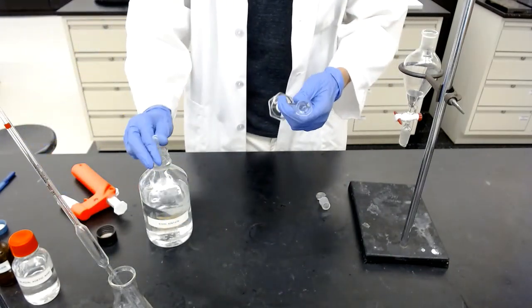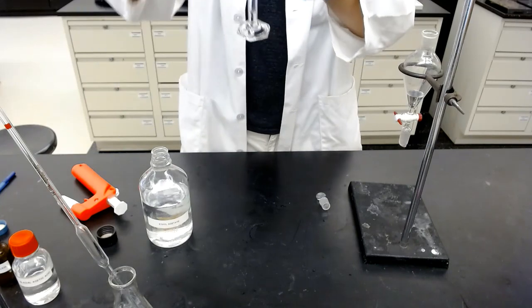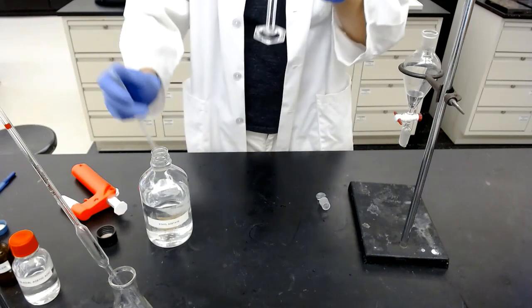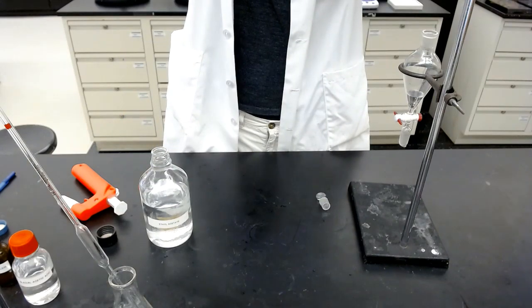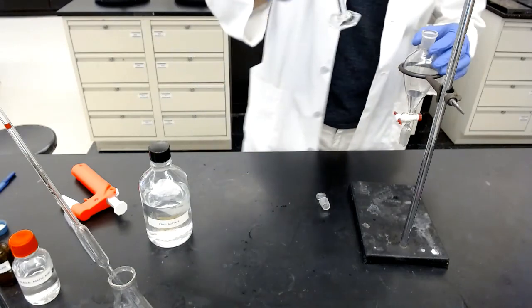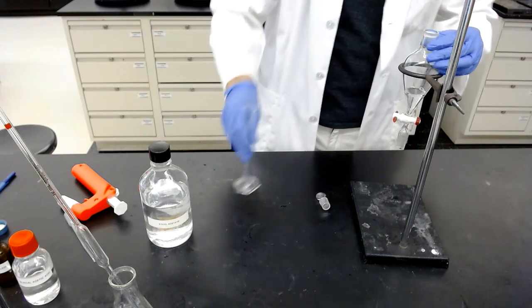So first we take in 5 ml of ethyl acetate. Right? 5 ml of ethyl acetate added to the 10 ml of the stock acid solution.